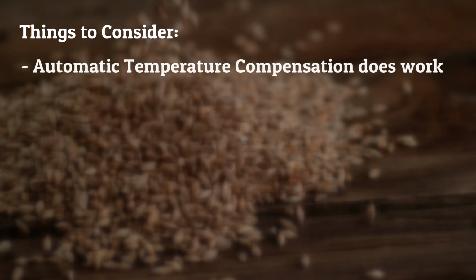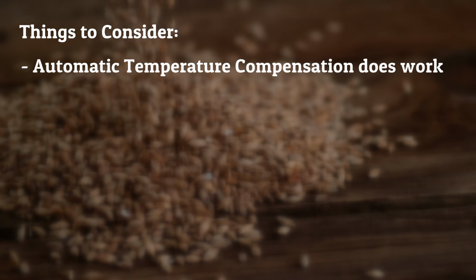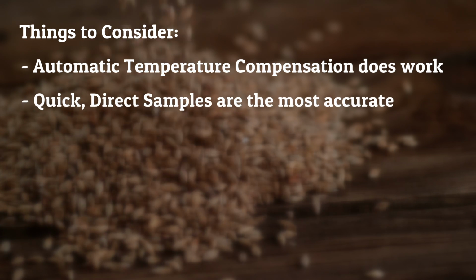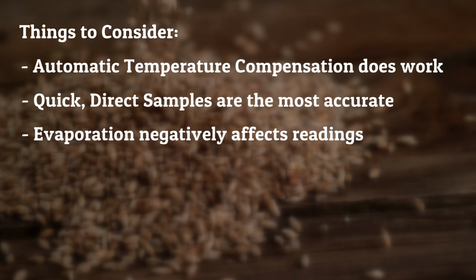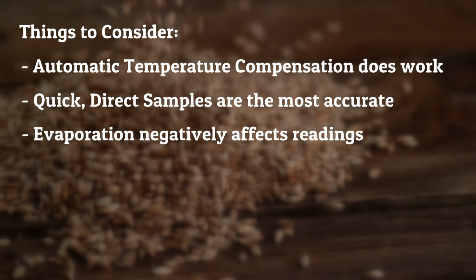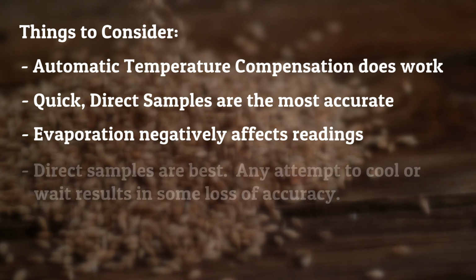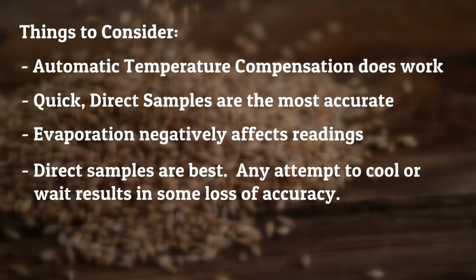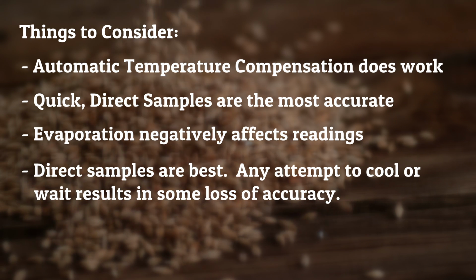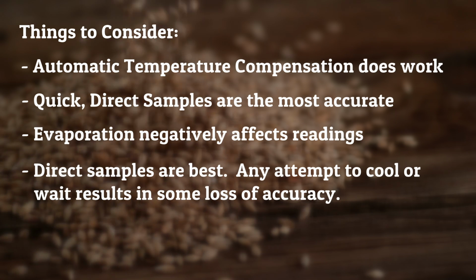Okay, some things to consider. The automatic temperature compensation does work well. That's good to know. Quick, direct samples are the most accurate. Evaporation negatively affects readings. It's best to take your sample quickly, put it on the platter quickly, and then take your reading quickly for the most accurate results. Direct samples seem to be the best. Any other attempt to cool the wort is actually taking away from some of your accuracy due to evaporation. So once again, quick and direct seems to be the best approach.